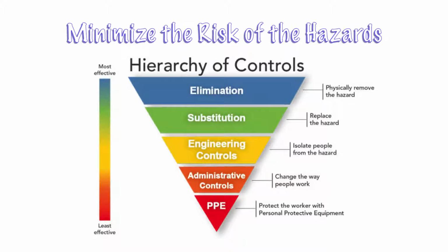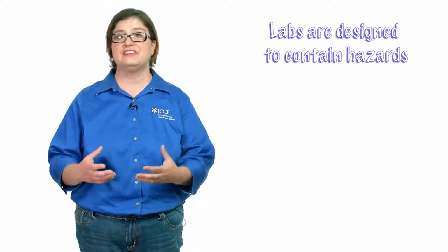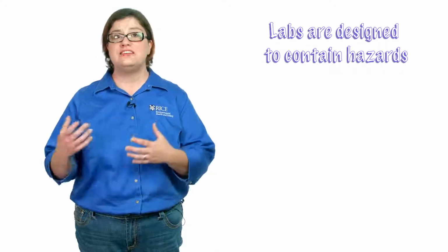Three of the controls that I want to discuss more are engineering controls, administrative controls, and personal protective equipment. Engineering controls are going to include interlock devices as well as laboratory ventilation. So let's first talk about ventilation. Laboratory ventilation is designed to contain hazards inside the laboratory. So any spills or incidents in the laboratory should remain inside the laboratory.